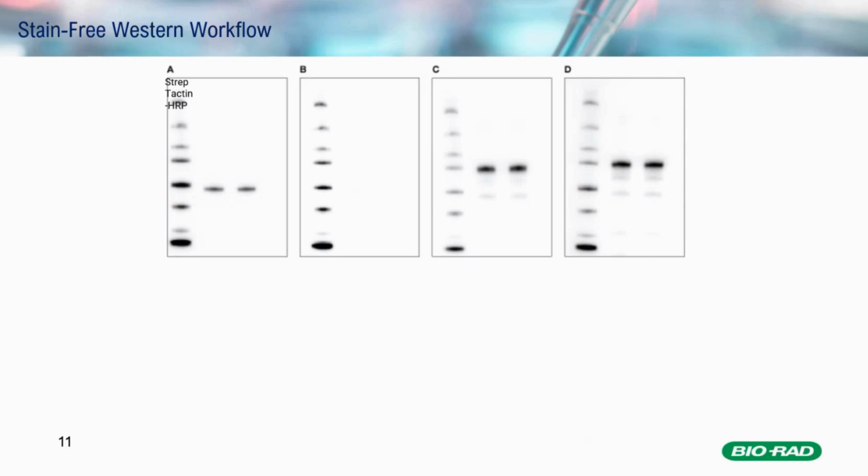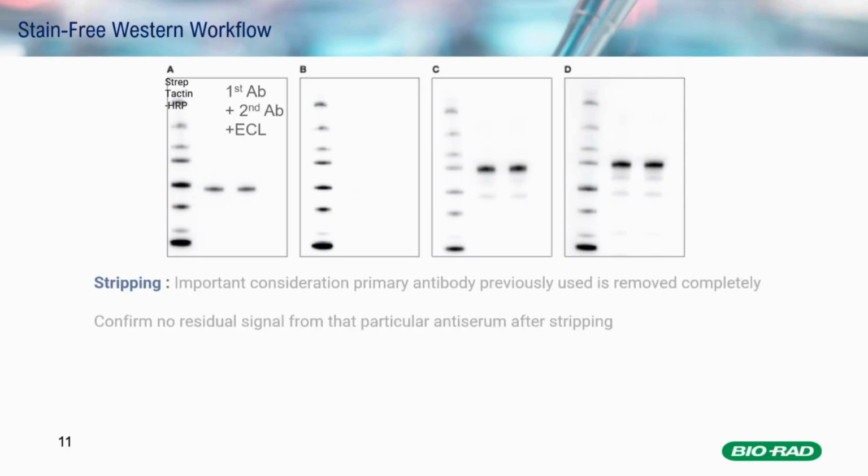And the other important point: when you run stripping applications, there are several important considerations related to primary antibodies. You need to confirm you completely remove the primary antibody from the first application.